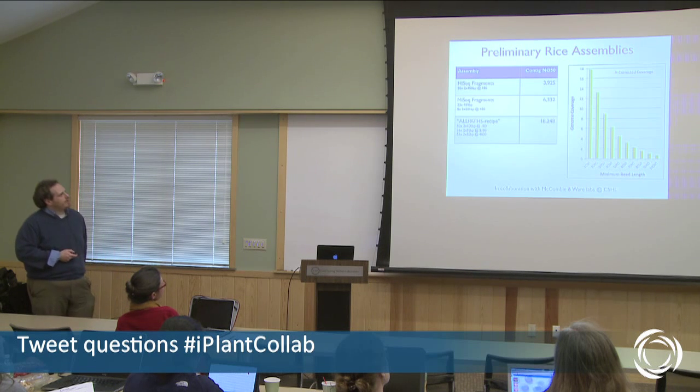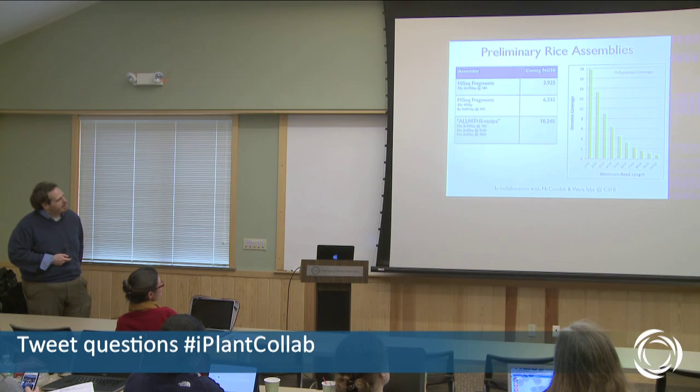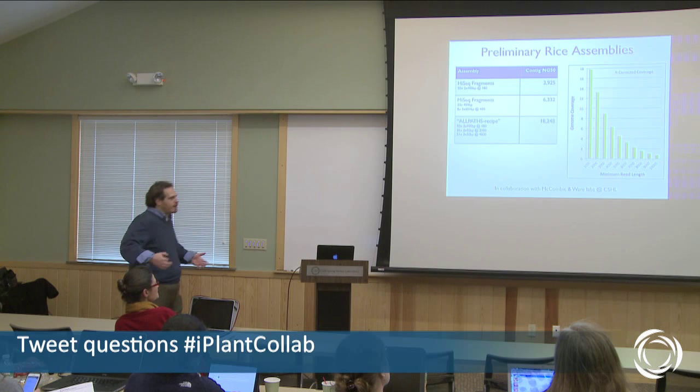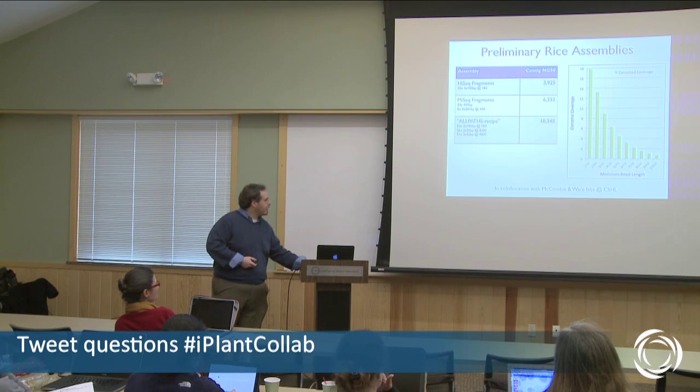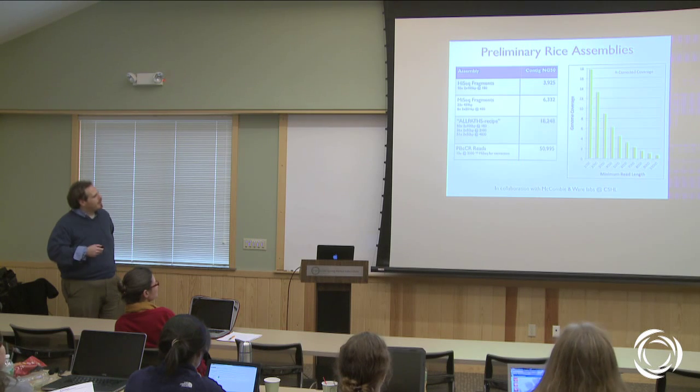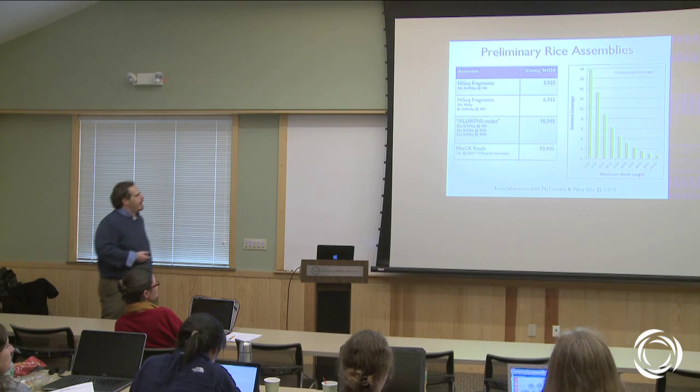In addition to this, we have done quite a bit of PacBio sequencing. The way to read this graph is, of the reads that are 1,000 base pairs or longer, we have just shy of 18x. Of 2,000 or longer, we have about 13x. Of 5,000 base pairs or longer, we have 4 or 5x or so. So we have quite a bit of this extra long read data. Using the algorithm that we published a year ago, it improves the assembly by about a factor of, but not quite, 3. We were pretty happy with that.